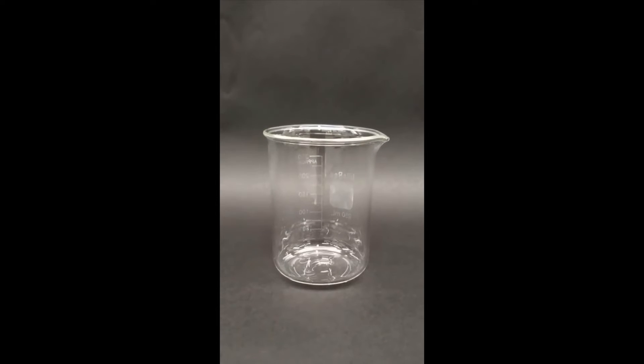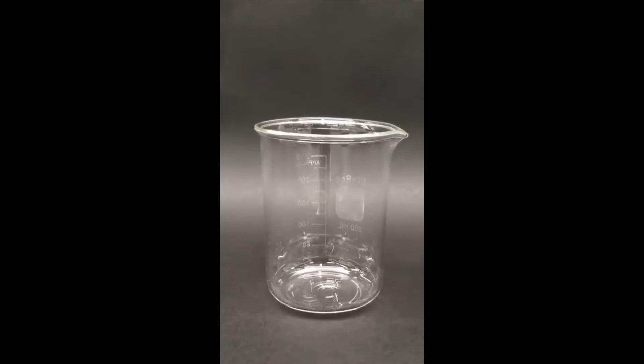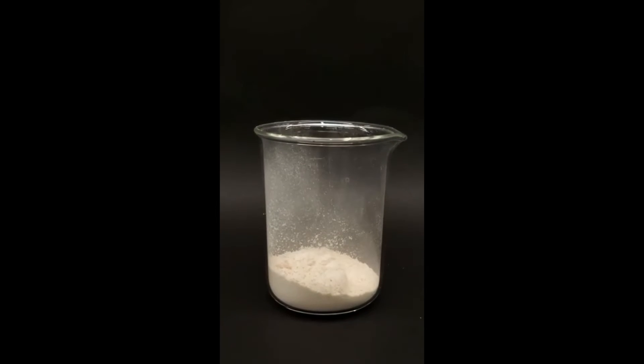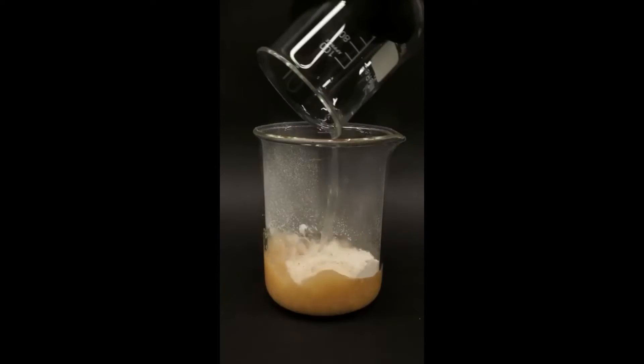So today I'm going to be making some fireballs. To do this, I have to start with some white powder called calcium acetate. Now I have to add some water and dissolve it.